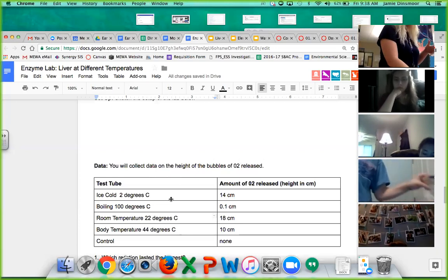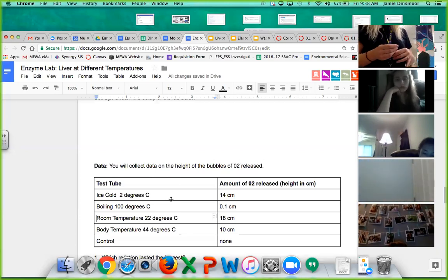But basically, the way that we could prove this is we could have an ember on a piece of wood, right? And if we place it above the reaction, it will ignite because of the oxygen, because oxygen fuels fire. So if oxygen is being released, if we place an ember above the reaction, we will see like a little poof explosion. And possibly the wood could catch on fire again, which is pretty cool. So we might go on a little trip to look for a lighter.